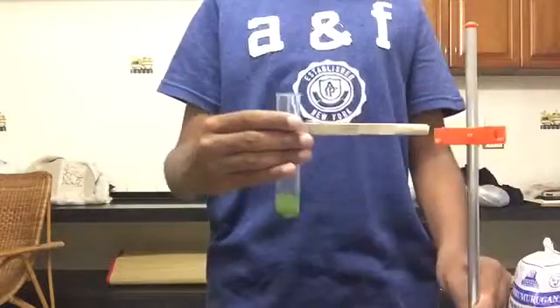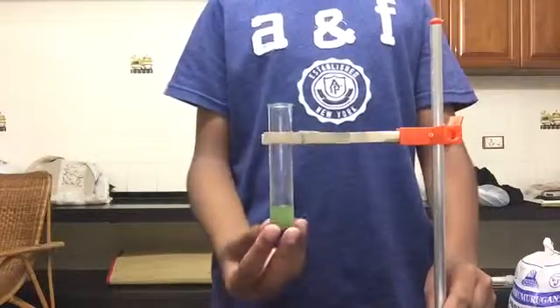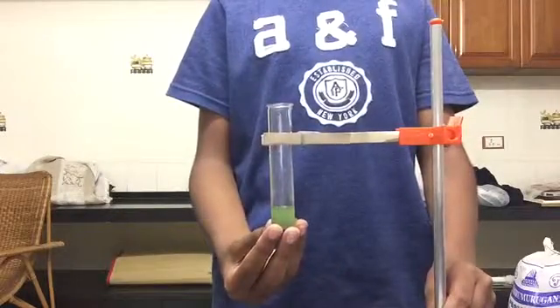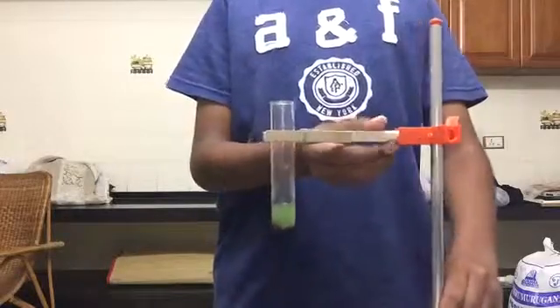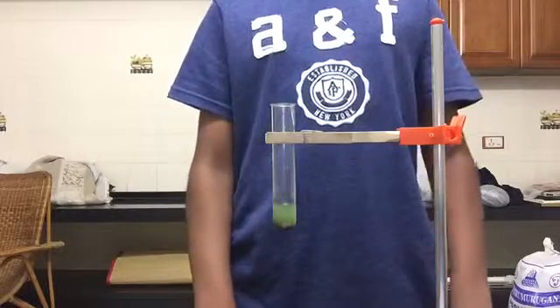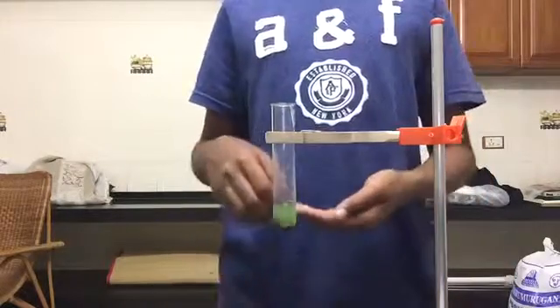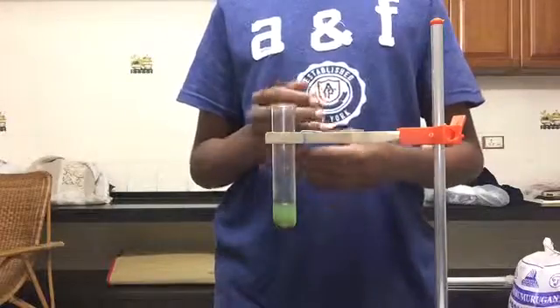This green solution is actually ferrous sulfate, or iron sulfate. If you feel the test tube here, you can feel some heat, which shows that this is an exothermic reaction. What happens is that copper has been displaced — in scientific terms, kicked out of its place — and iron has taken the place of copper, producing iron sulfate and giving out a residue of copper.